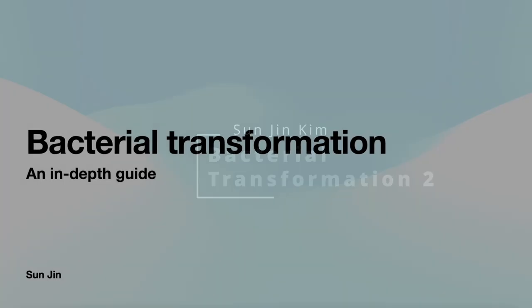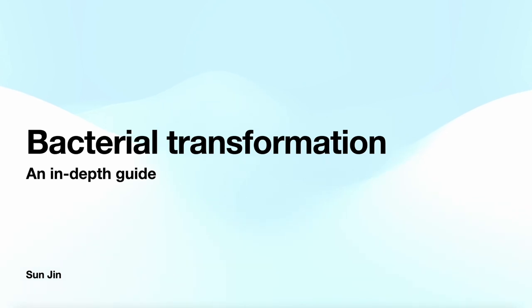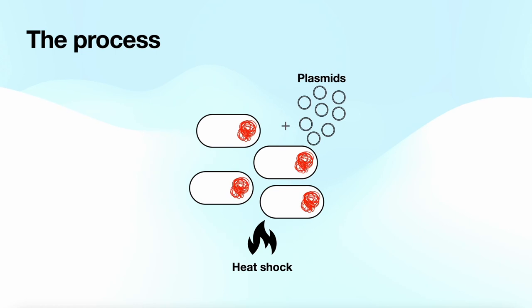Welcome to my presentation on bacterial transformation. I, Morgan Freeman, will be your guide. The process begins with the plasmids and a unique bacteria without a plasmid getting mixed. The bacteria are given a heat shock, which allows some of the plasmid to enter the bacteria.